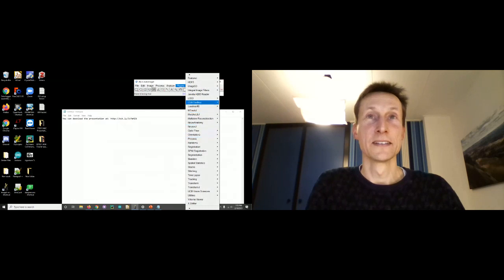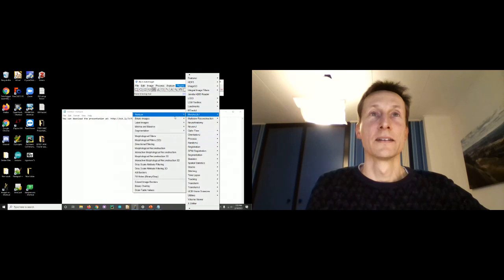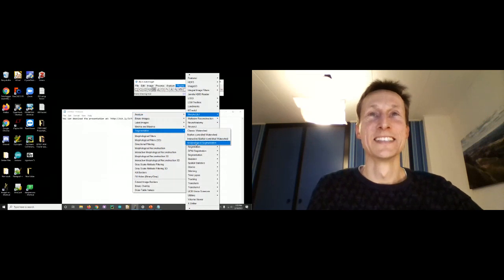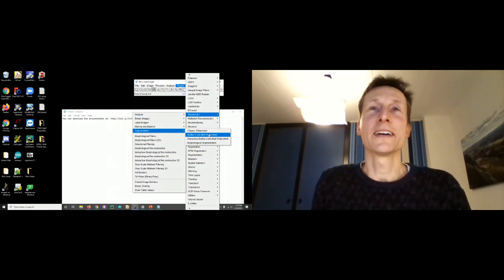But if MorphoLibJ is what I'm thinking of, is that the guy who wrote these? Yeah, dude, these are some of the best tools ever. Morphological segmentation. That is so good. And actually, I use this all the time for tracking objects. Yeah, the marker-controlled watershed, that's great.